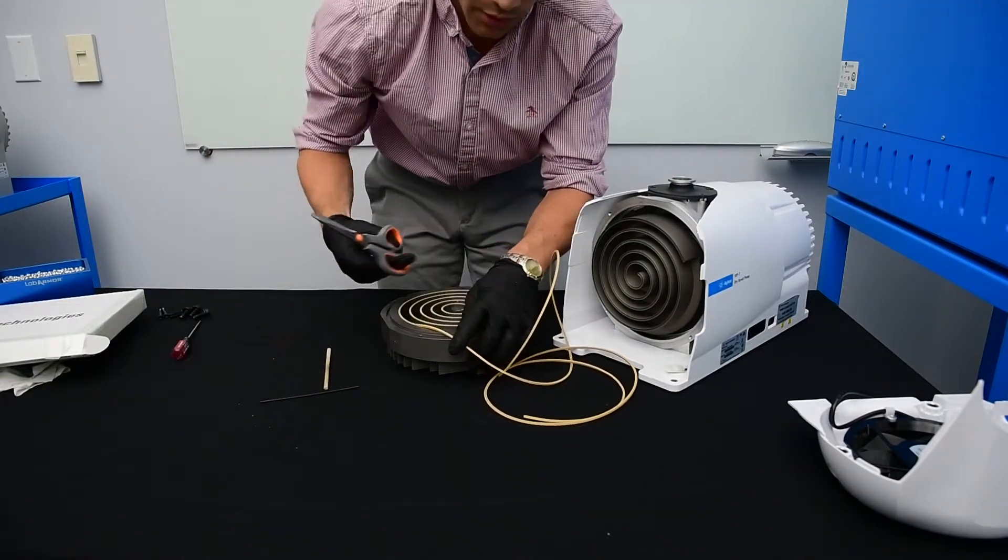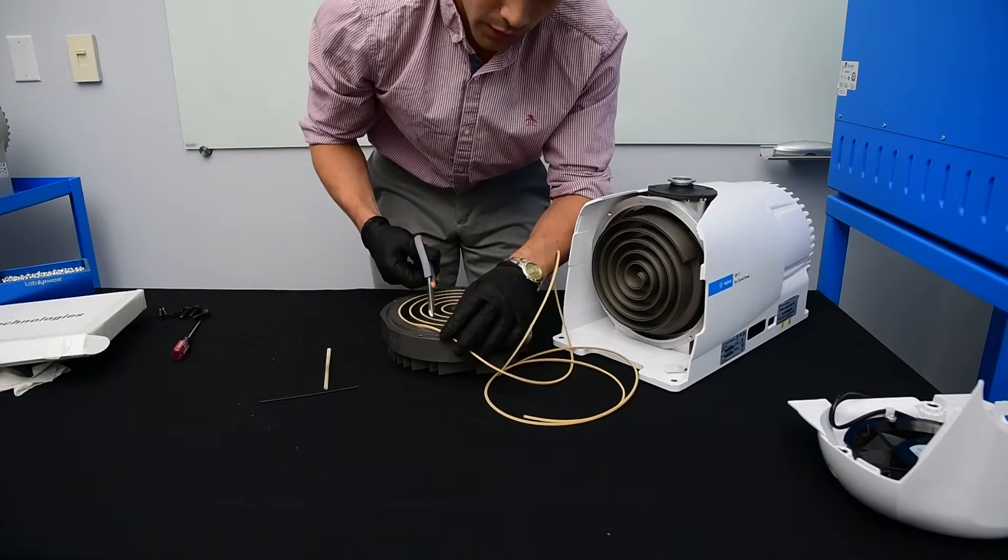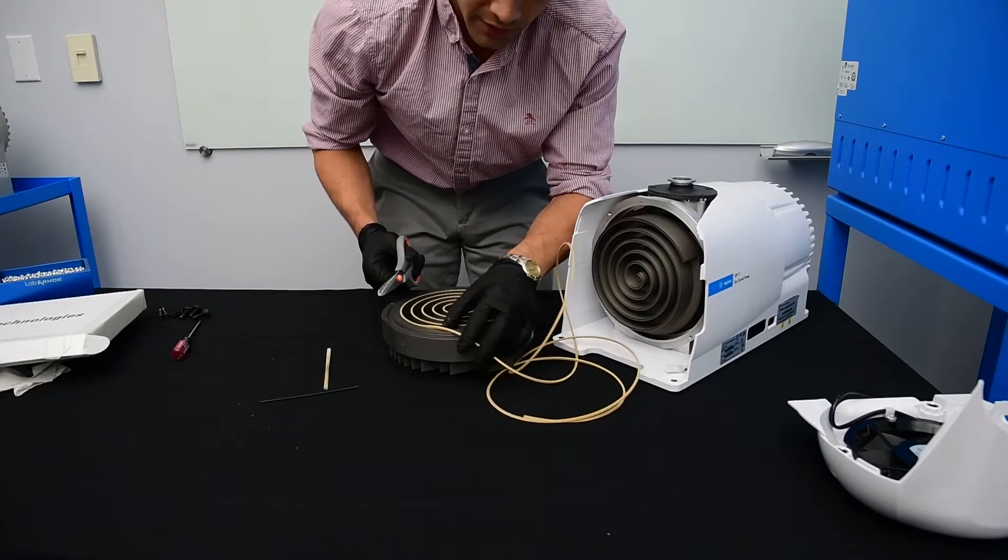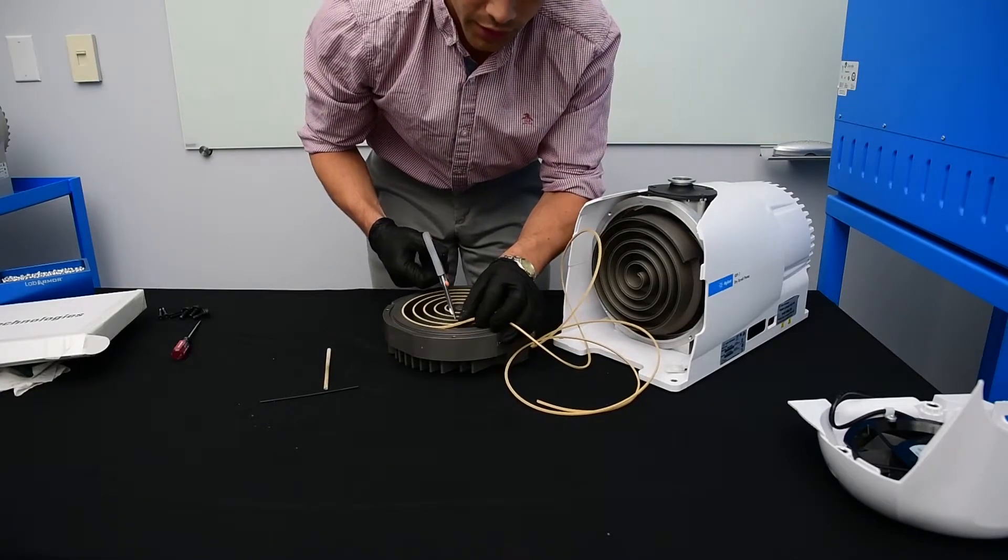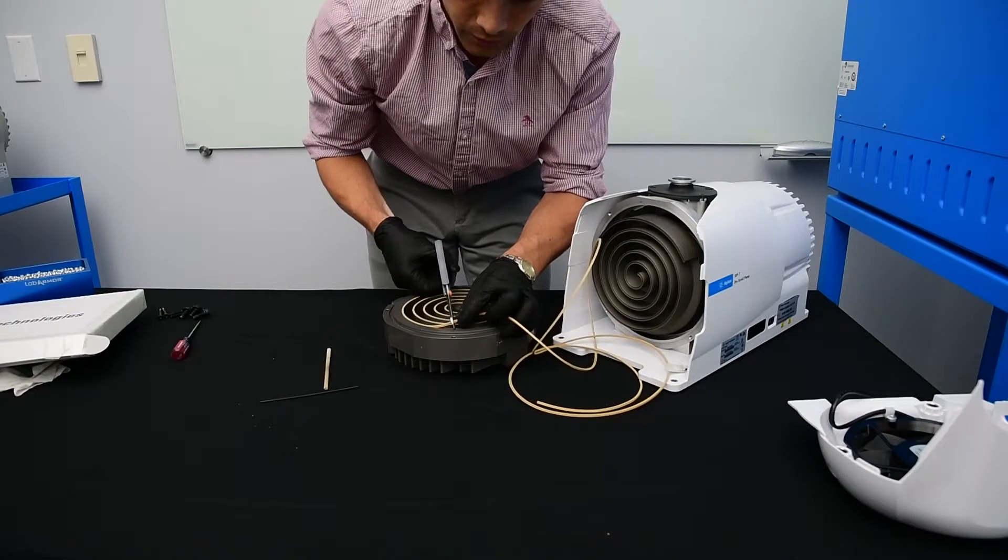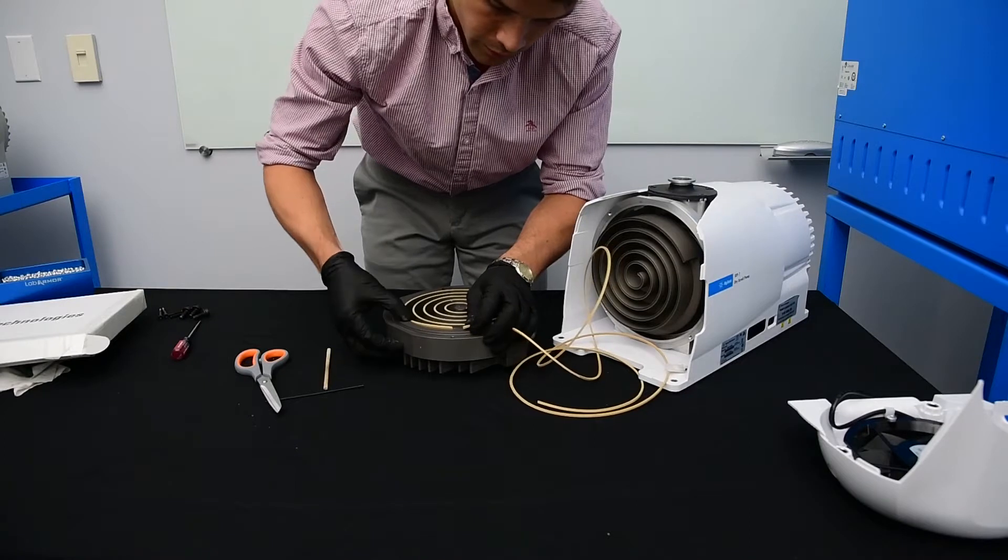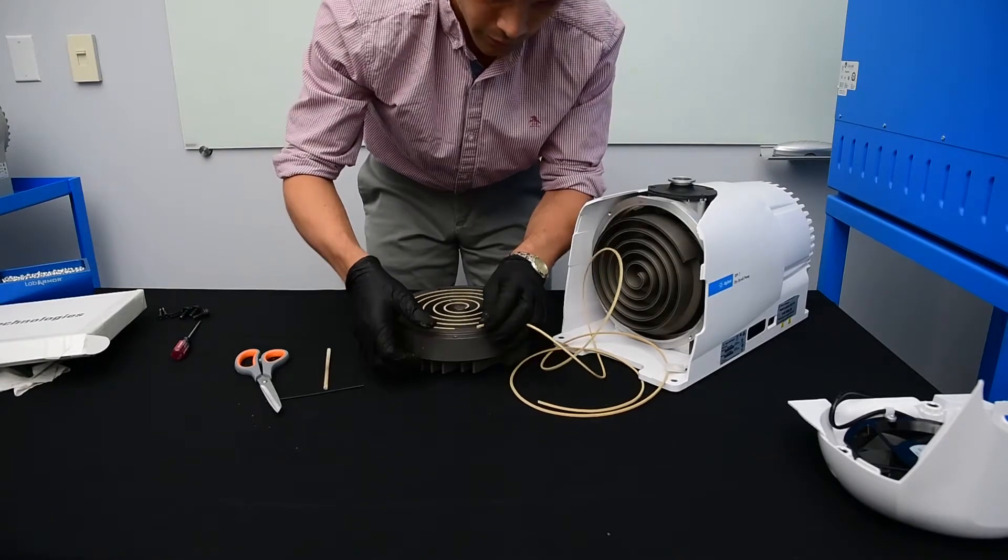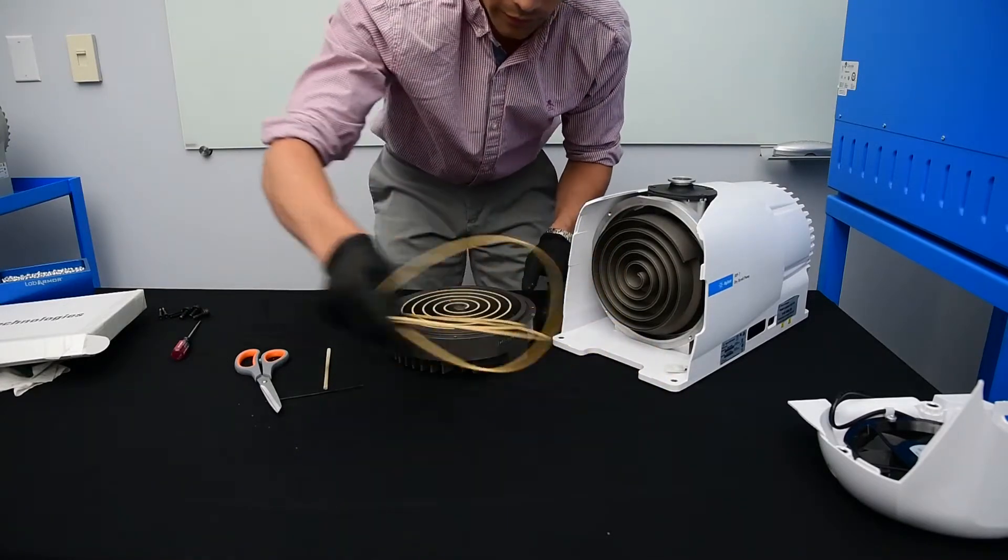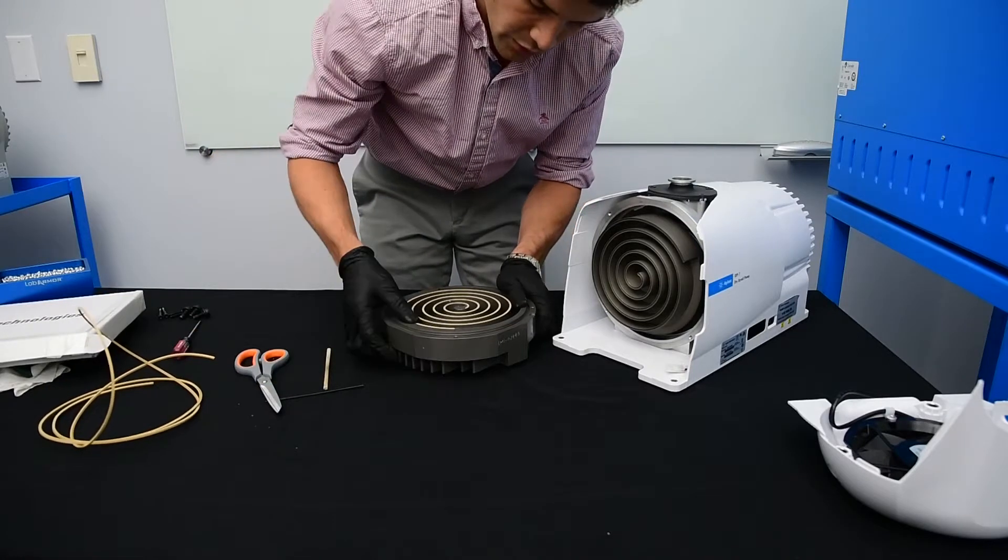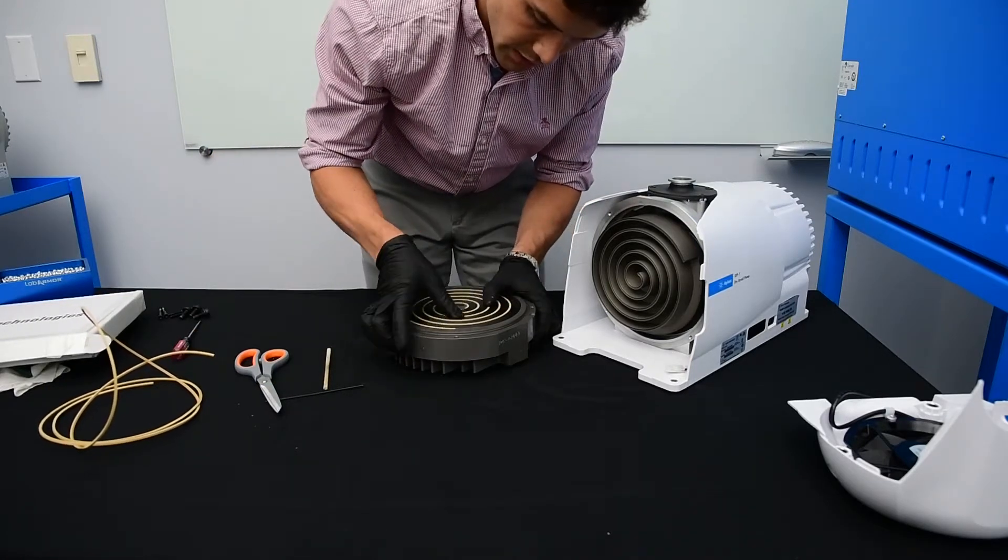Now using scissors or a pair of diagonal cutters, we're going to cut the tip seal shy of the end of the groove by a quarter to an eighth of an inch. Now go over and make sure the tip seal is firmly seated.